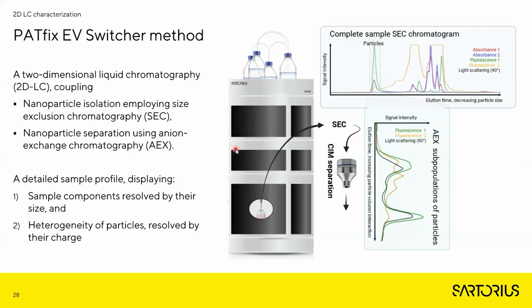So I would now like to quickly describe our further, more advanced techniques to analyze even further the heterogeneity in the particle population.